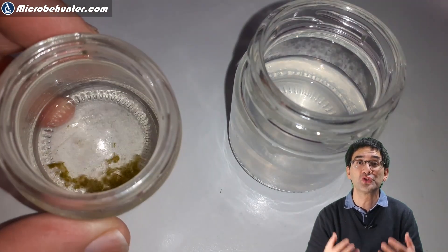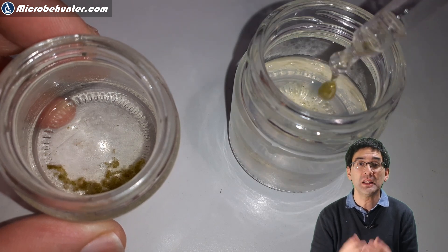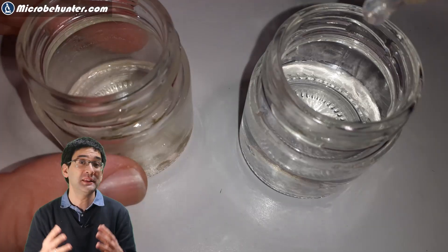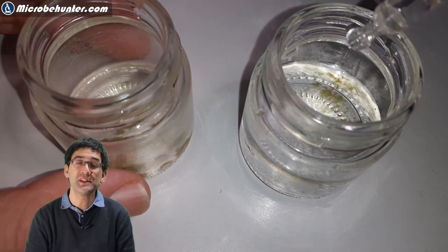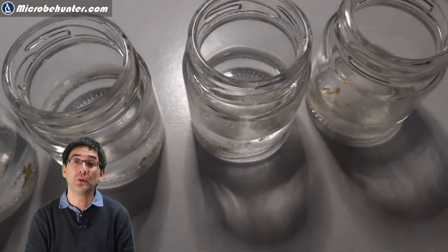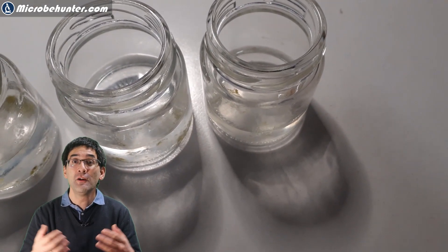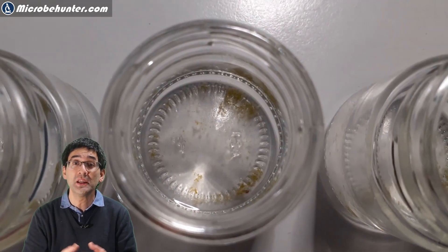Otherwise bacteria are going to grow so rapidly that they are going to take away the oxygen in the water sample. I've also added a few algae, and they are quite important and good because they do photosynthesis and this way they also provide more oxygen. Then you have to be patient for about two or three days, because this is how much time it takes for the ciliates and other microorganisms to actually start growing in the water sample.